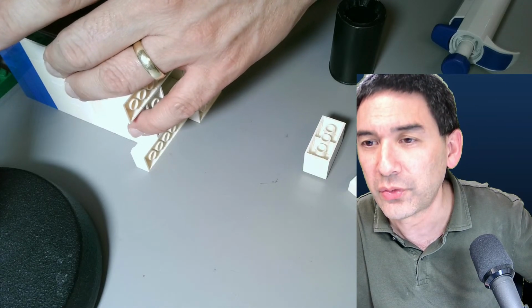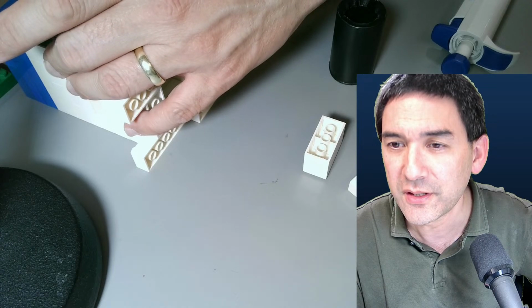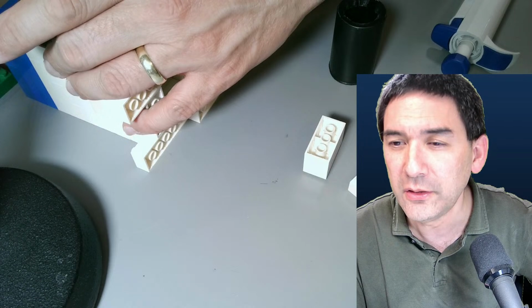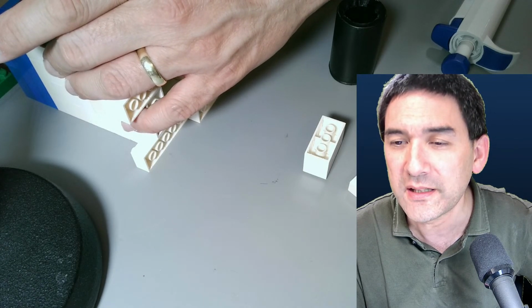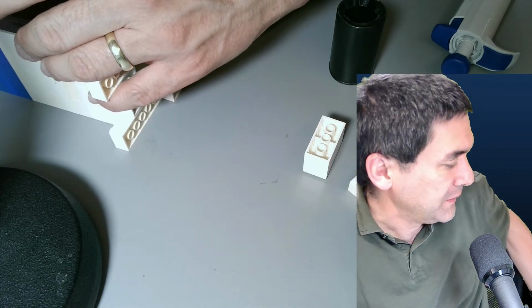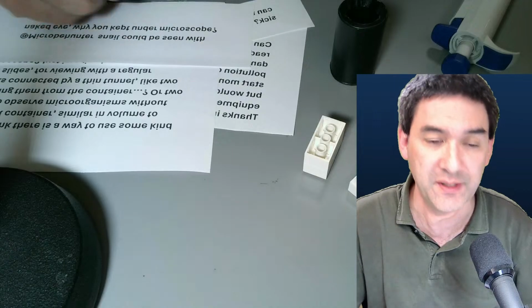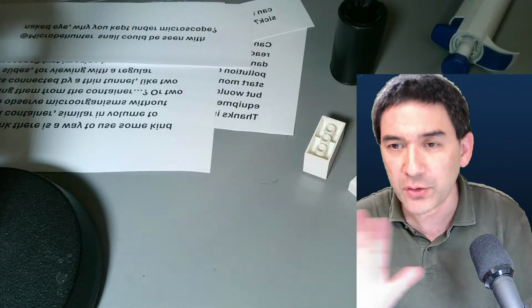I'm just going through the questions again. Can it be varied with the camera, such as zoom capability? Yes. We are constantly in contact with bacteria, and people even go swimming in ponds and lakes. What makes the bacteria in your jar potentially more dangerous than the ones around us? Good point. I will tell you the following. They're not necessarily more dangerous, but there's one important difference. Your point is completely valid.